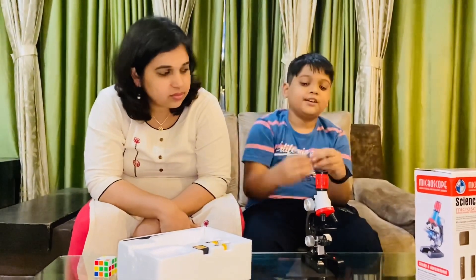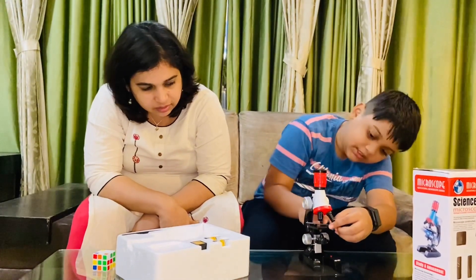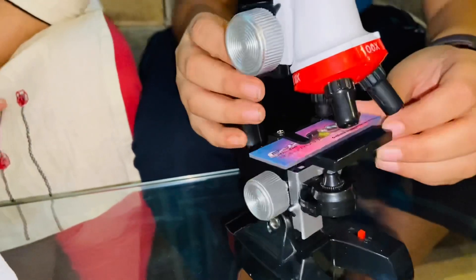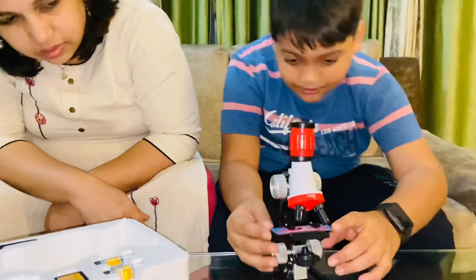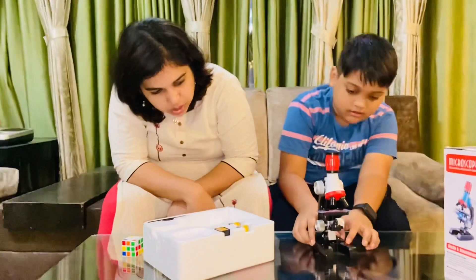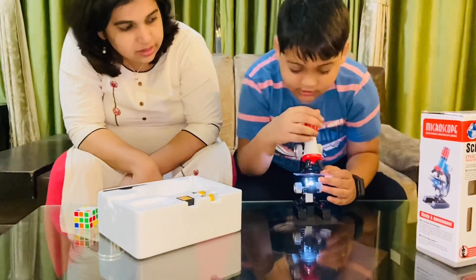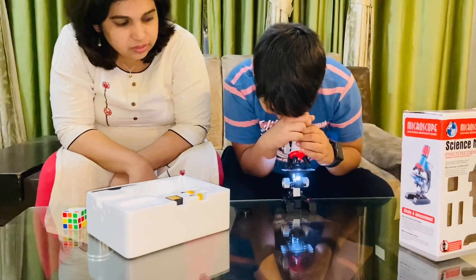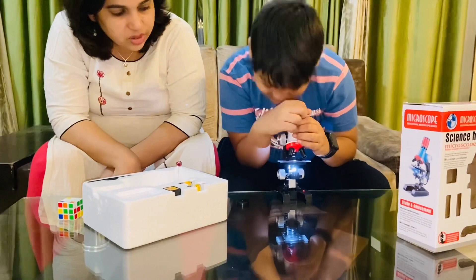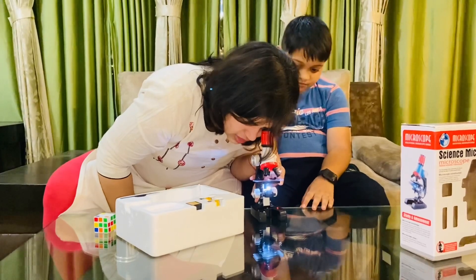You place the slide here and attach it to the clips so it is fixed in that spot. Then you switch on the light and try to see through the lens. Let me take off the cover — yes, I can see something! You fixed it so nicely, it is so clearly visible.